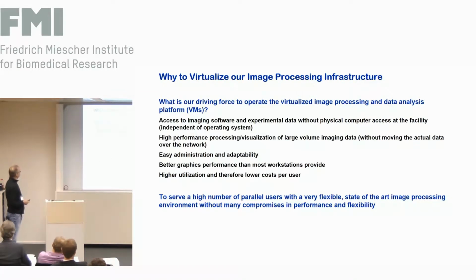So what we thought we should do, first of all, people were using their independent workstations. And one of the eye-openers was that people sitting in front here do nice image processing. Unfortunately, you need a special workstation with graphics cards. And we realized over the past years that research groups very often didn't have the appropriate hardware. So the image processing failed. And that was one of the reasons why we thought, if we manage everything, then at least we can solve all these problems. And that's what we did, something like 3 years back.